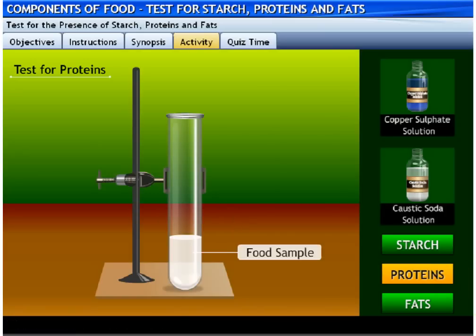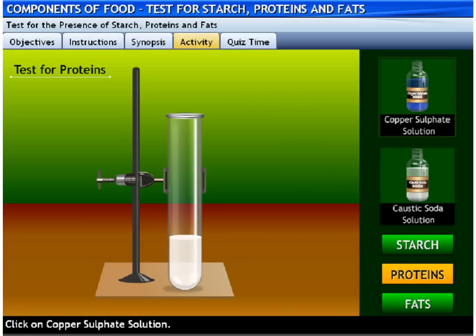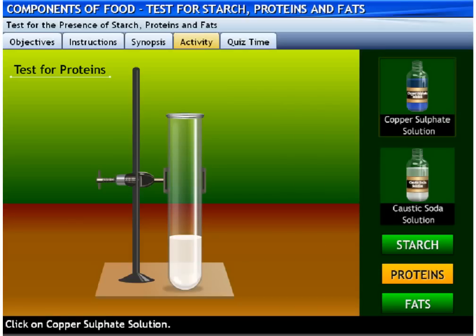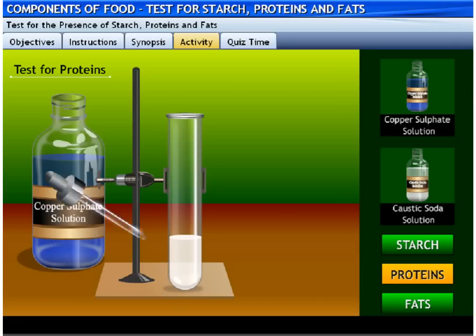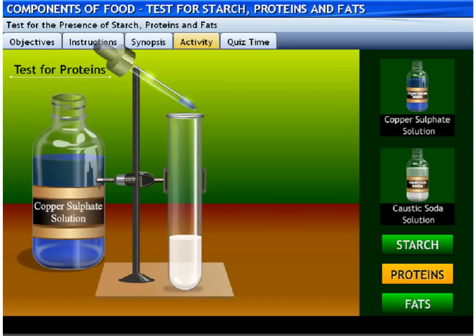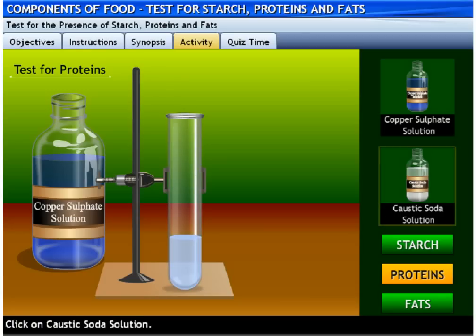The food sample to test the presence of proteins is kept ready. Click on copper sulfate solution to pour 2 drops of it on the food sample. Click on caustic soda solution to add 10 drops of it to the food sample.